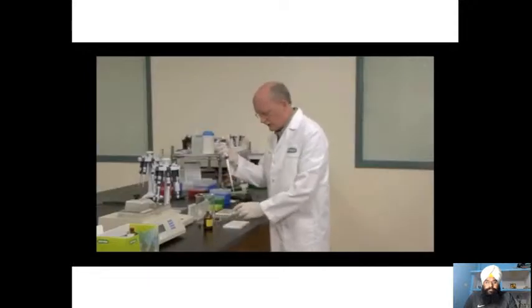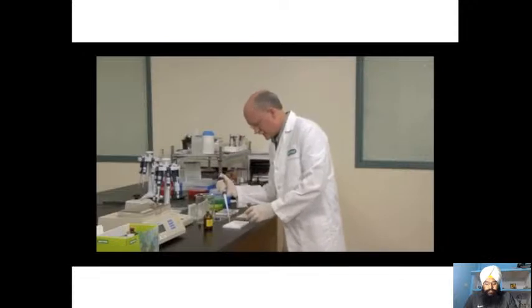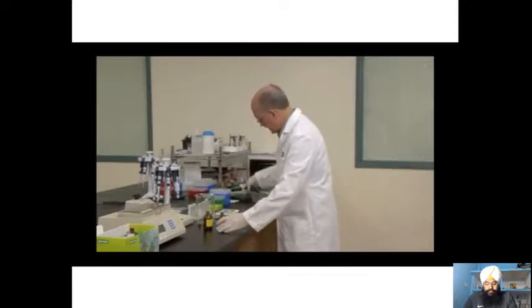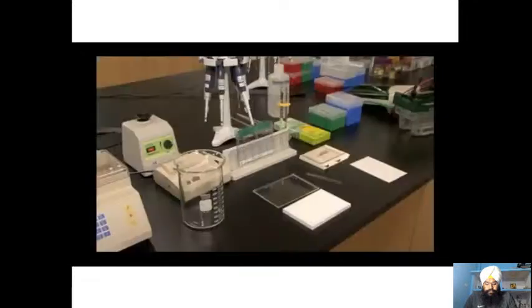Now add 2 milliliters of buffer number 2. Shake for 15 minutes and pour out. At this point, the strips are ready to run on the second dimension gel. I am going to use Biorad's Criterion precast gels, which accommodate the 11 centimeter IPG strips that we ran earlier.